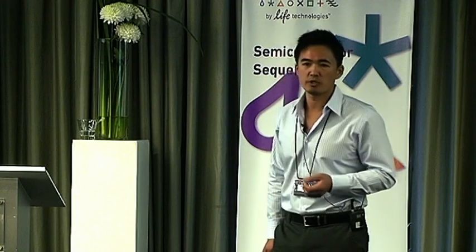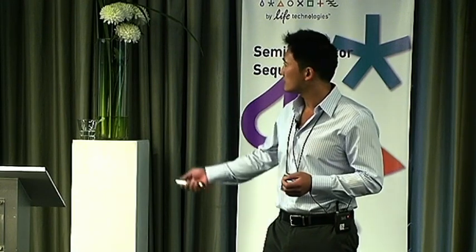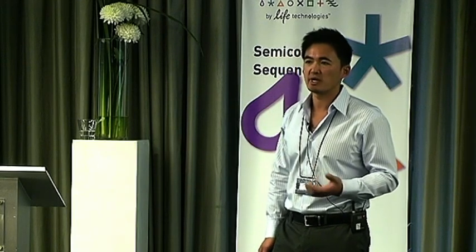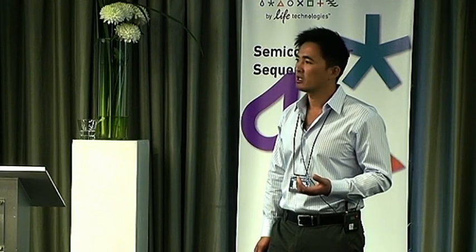So because of that, what happened is Life Technologies acquired open array technology. We actually bought a company called Biotrove in early 2010. So this actually is a much more mature platform. The Biotrove system has been out in the market, I believe, since early 2006. And when Applied Biosystems at the time, before the merger with Life Technologies, what happened is that they recognized the potential for the system for high throughput genotyping.